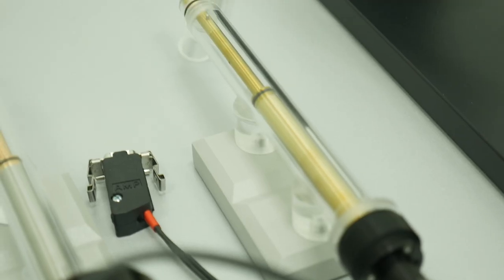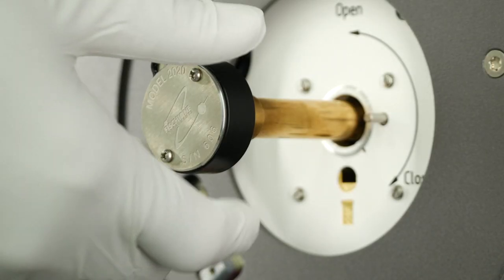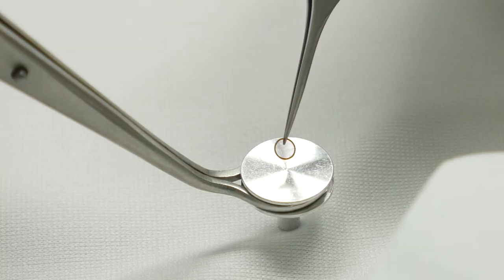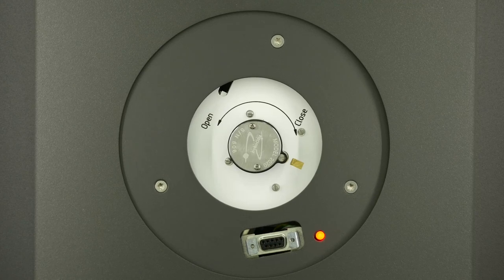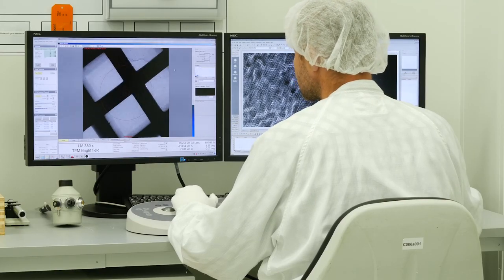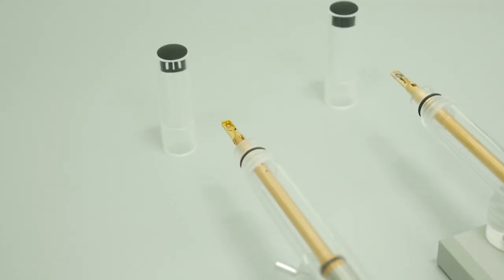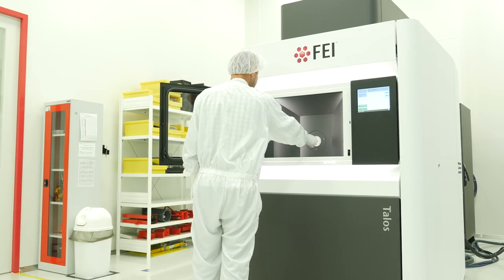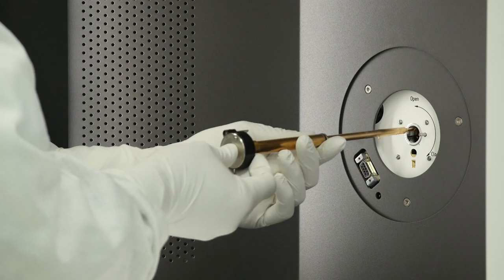Exactly. The sample for the transmission electron microscope is very thin, several hundred nanometers, and it is placed on a grid. If it wasn't thin, electrons would be stopped and no image would be created in the transmission microscope. There are various holders available for the examination of samples in the transmission microscope, depending on the application a customer would like to use. Here we can see a holder where more samples can be placed at the same time.